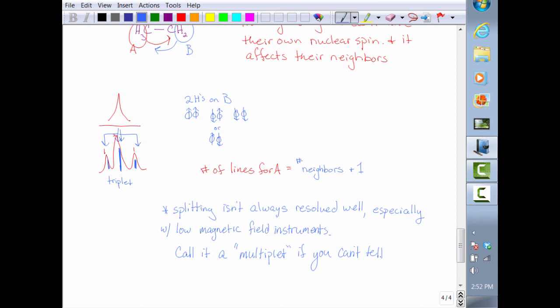Okay, so Megan and I can help you. Just raise your hand or shout when you need help. Once you identify your molecule, you're done and you can leave. But it would be great if you could empty out the NMR tube for me and just rinse it out a few times with acetone before you go.